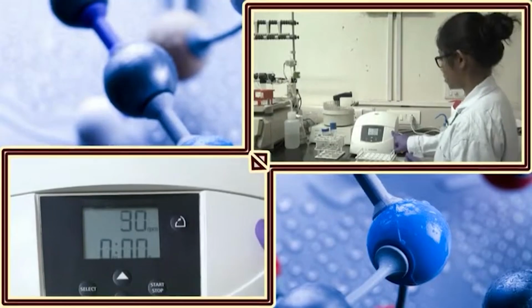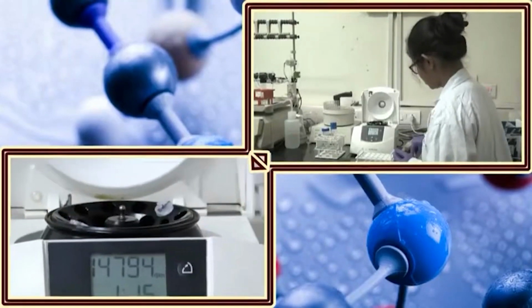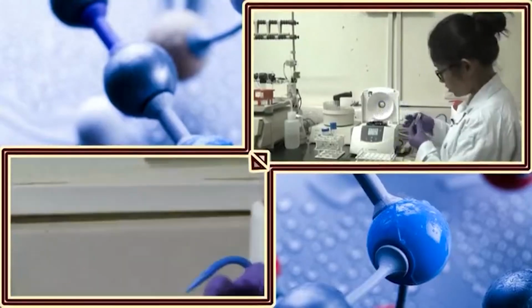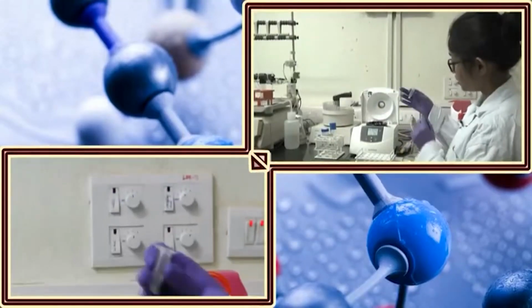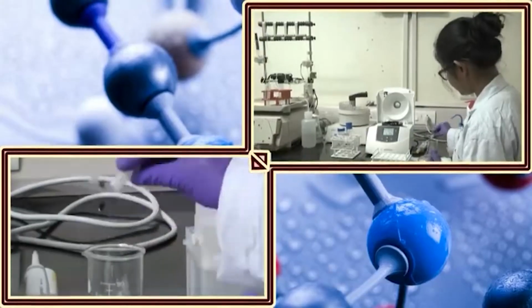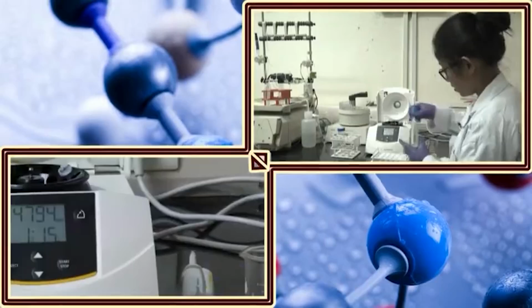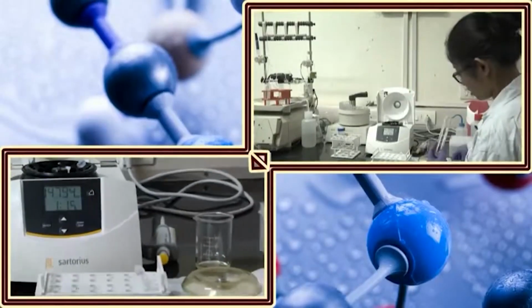My third round is also done. Again the supernatant is clear. I will again discard the flow through. And again I will take another 1 ml.